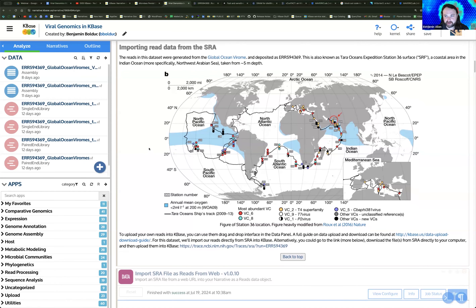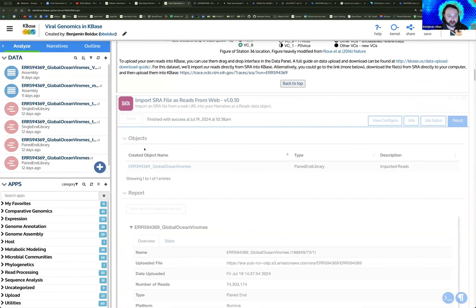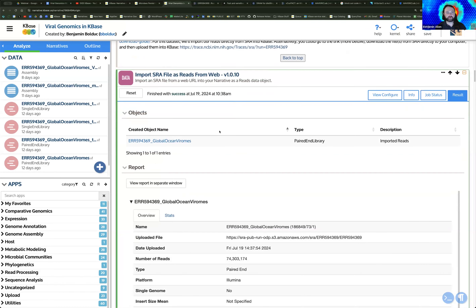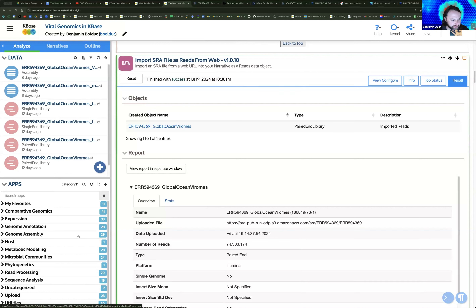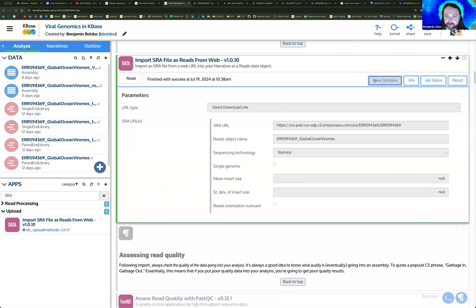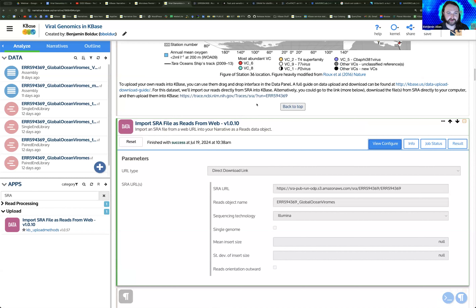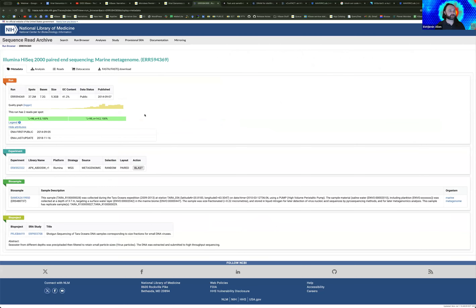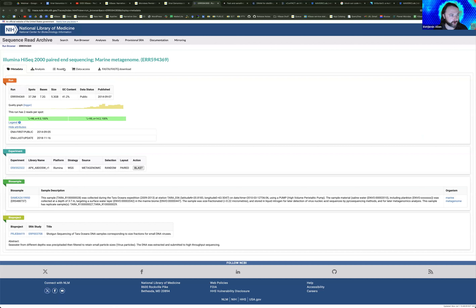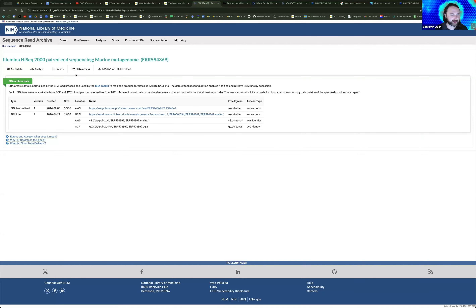This data is available in the NCBI Sequencing Read Archive. We have a tool called 'Import SRA File as Reads from Web.' You can access this in the apps panel — if you type in SRA, you'll find this importer tool. It's useful independently of this analysis because it allows you to directly pull data from SRA into the narrative.